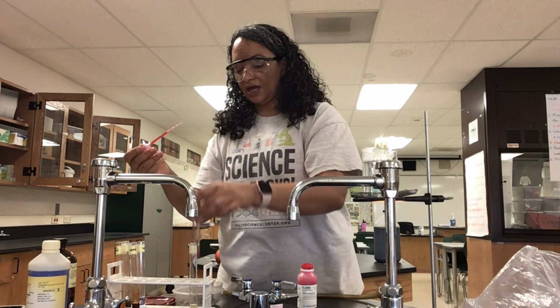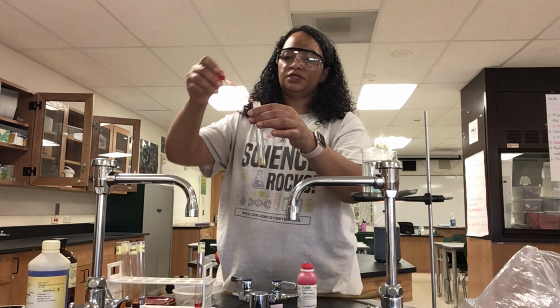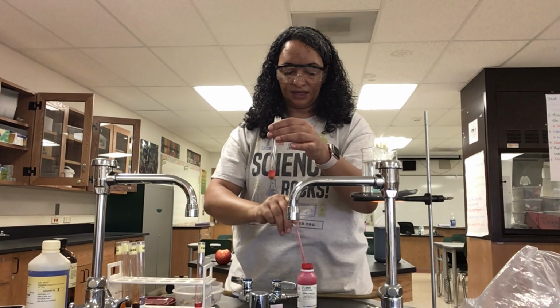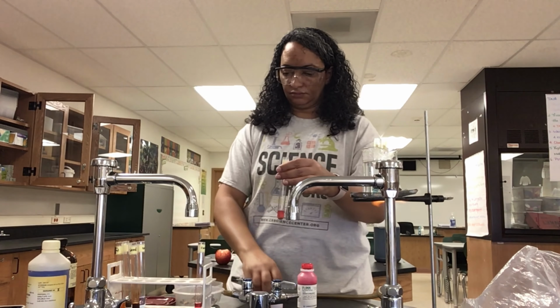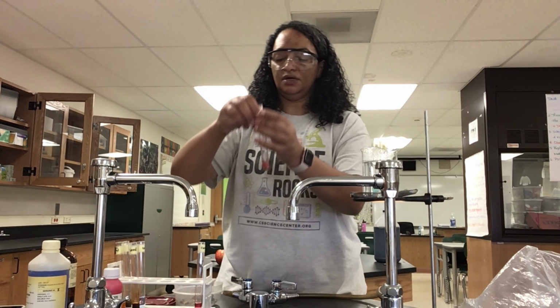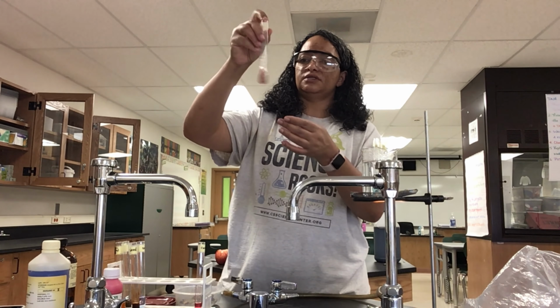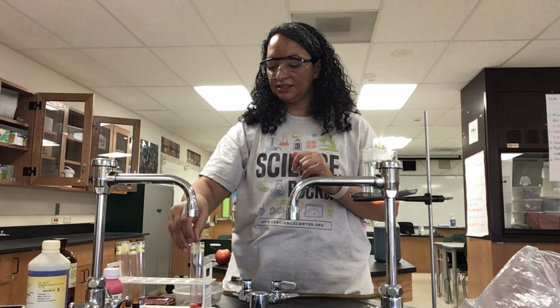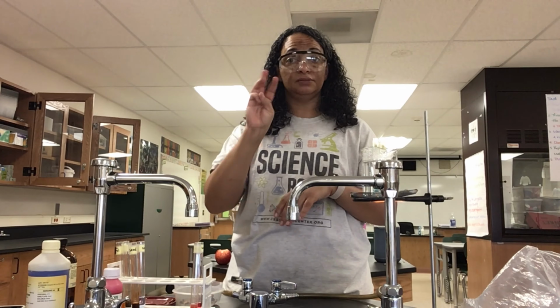So I got a nice red color. I'm going to squirt some into my seed. Squirt the extra back. Put the lid on this so I don't knock it over, because that would be something I would do. And then I'm going to mix this one up so it's nice and mixed in there. All right, we're going to let this one sit while the Benedict's is boiling, and we'll return in about 3 minutes.